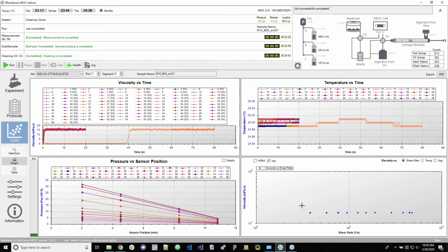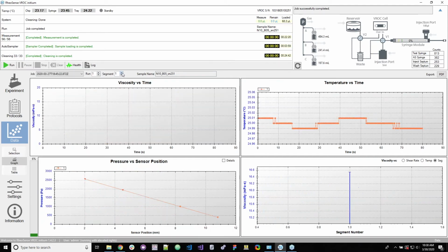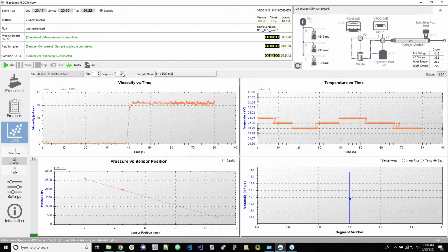And these N10 standards are Newtonian, which means their viscosity is independent of shear rate. It does not change as the shear rate is increased or altered, so it's a flat line. All right. And so if we look back up here, run 1, that's the first vial, and then segment 0 is going to show all segments. So if I click this, it will show me all the information from segment 1.